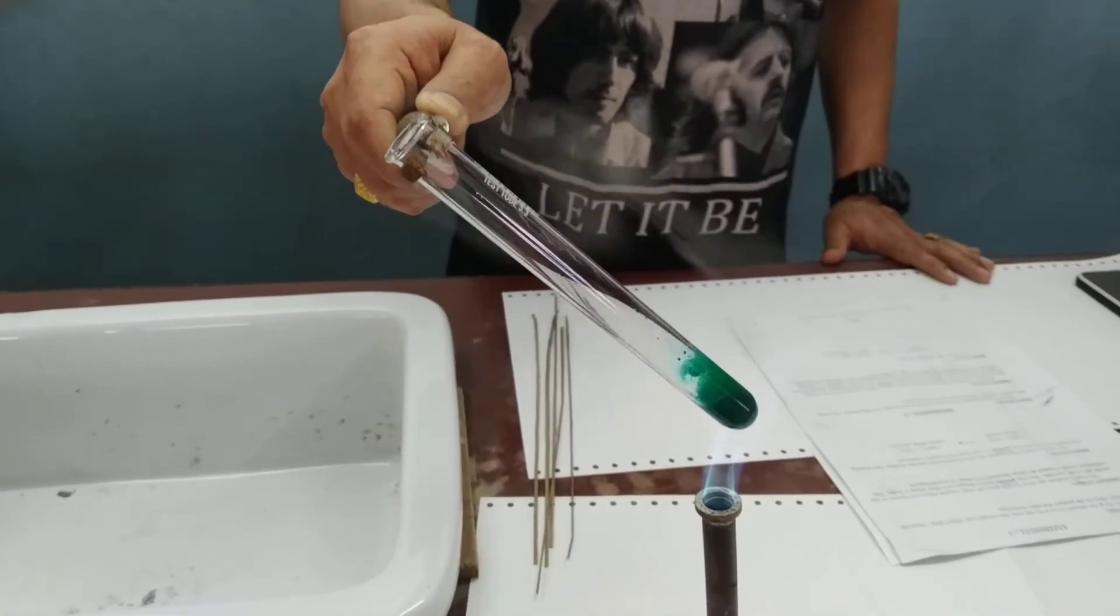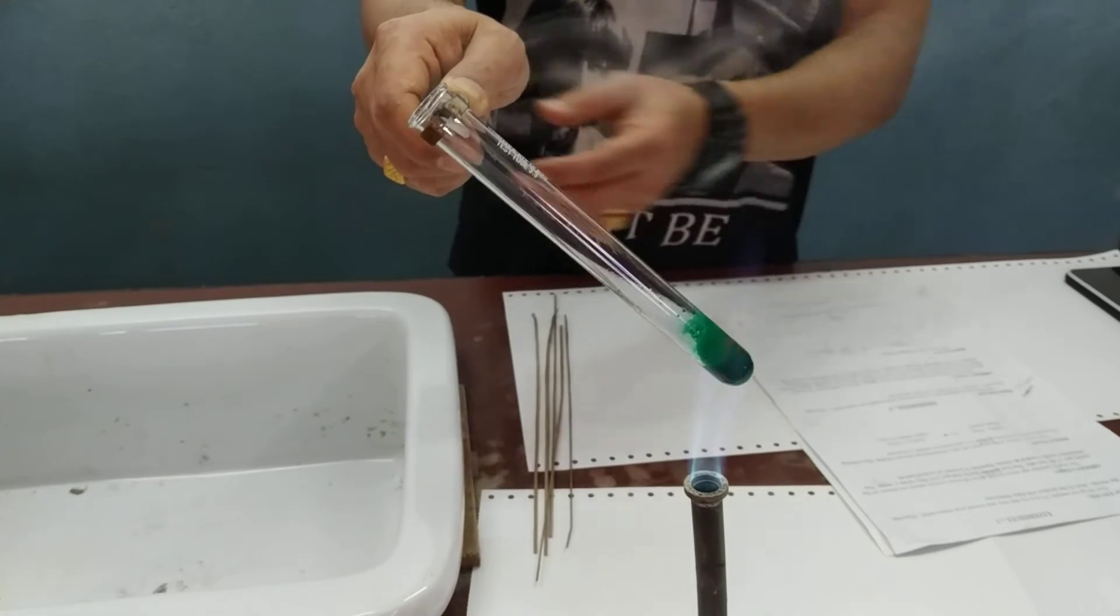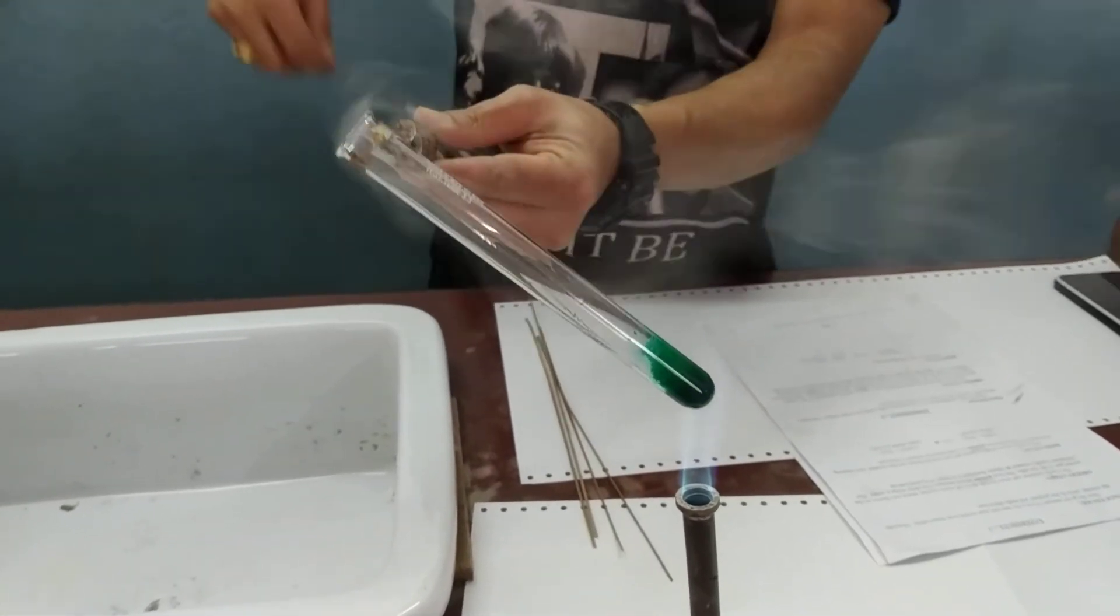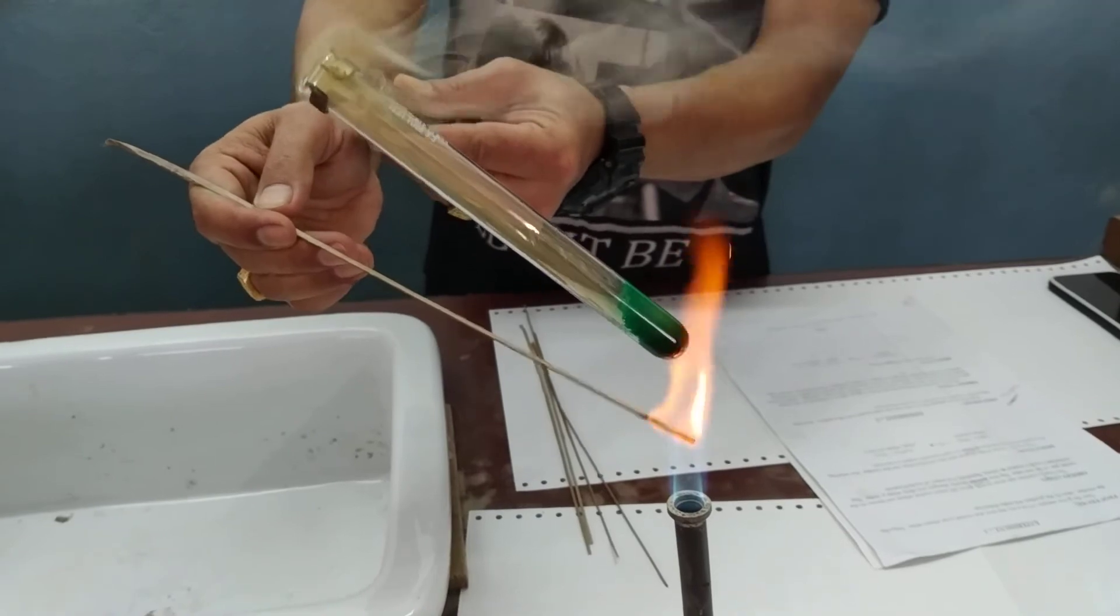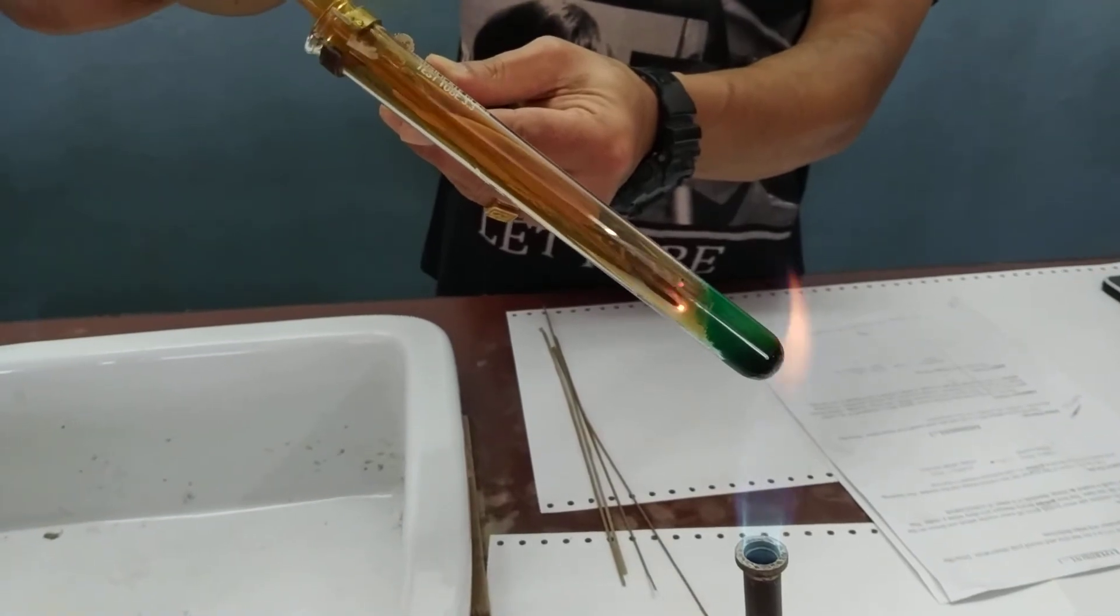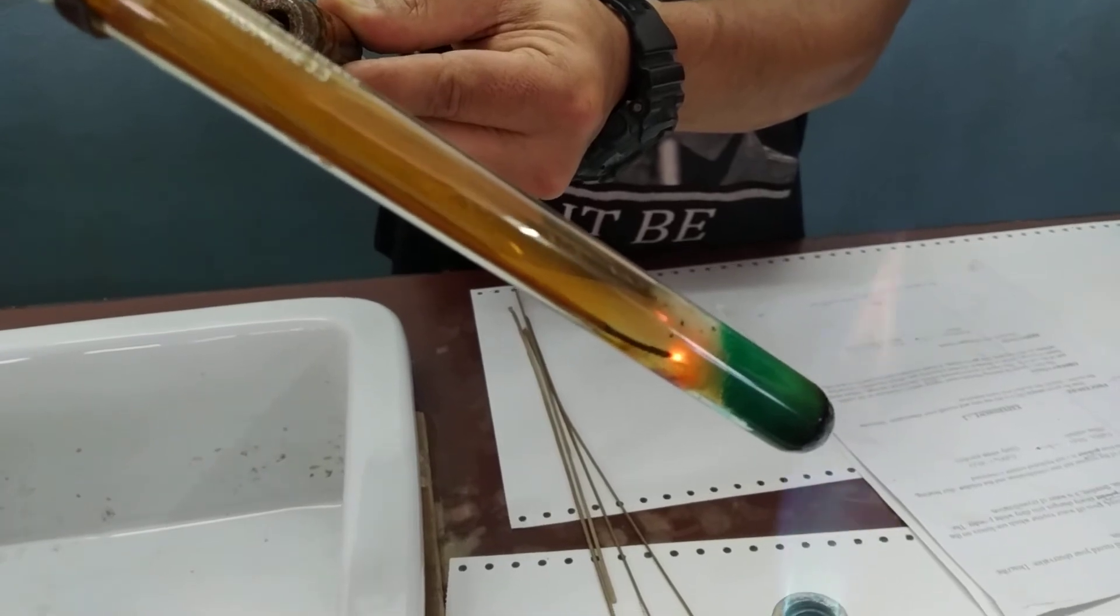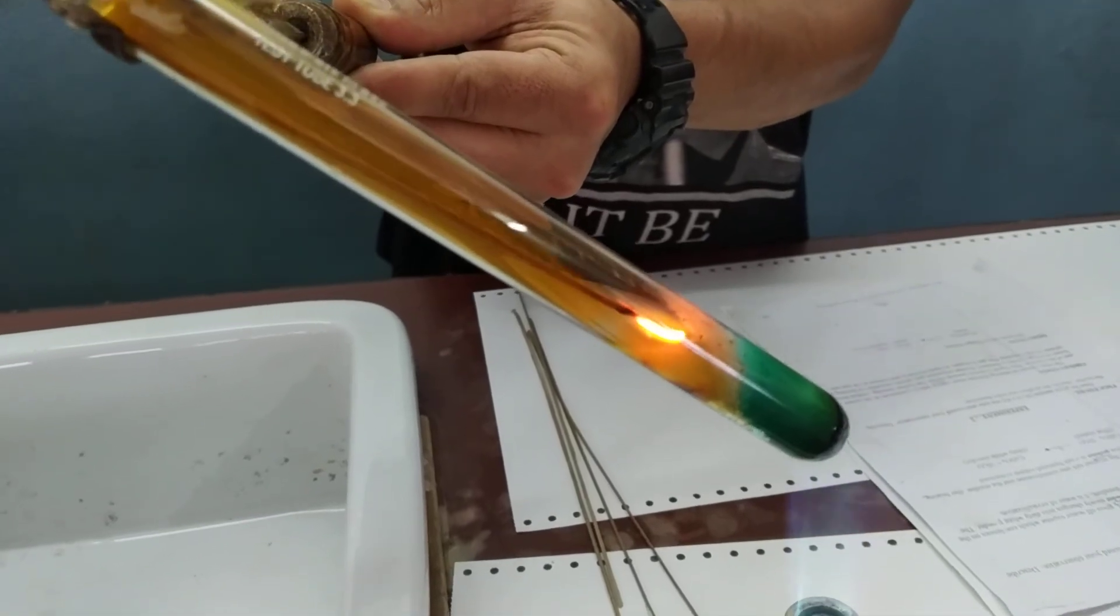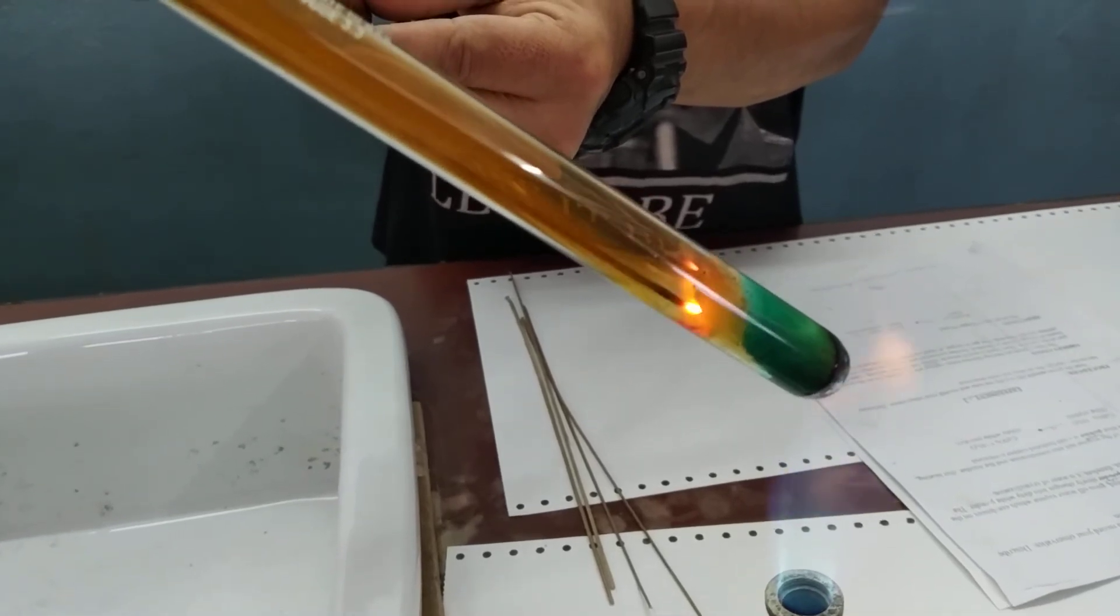The reddish brown fumes are nitrogen dioxide. The colorless gas that rekindles the glowing splint is also being evolved. As you can see now, the reddish brown fumes are visible, and the glowing splint glows brighter because oxygen is being evolved.